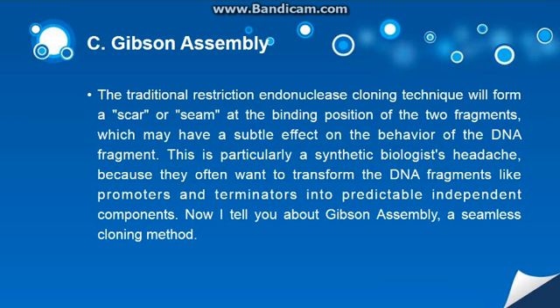Gibson assembly. The traditional restriction endonuclease cloning technique will form a scar or seam at the binding position of the two fragments, which may have a subtle effect on the behavior of the DNA fragment. This is particularly a synthetic biologist's headache, because they often want to transform DNA fragments like promoters and terminators into predictable independent components. Now I tell you about Gibson assembly, a seamless cloning method.